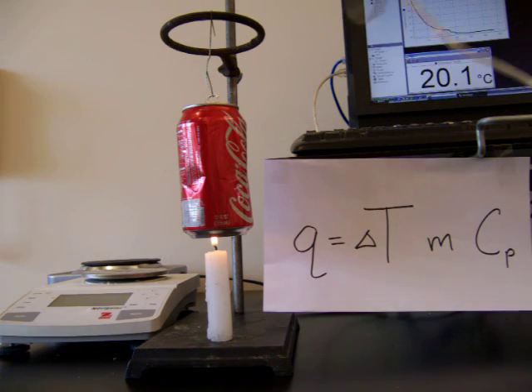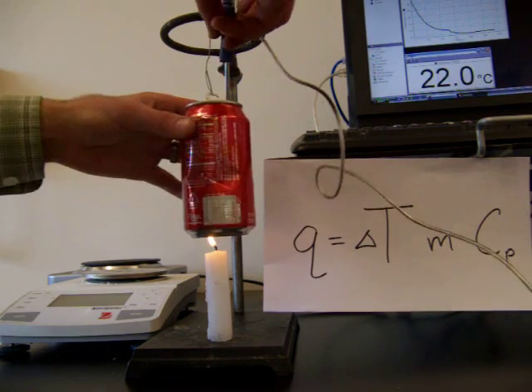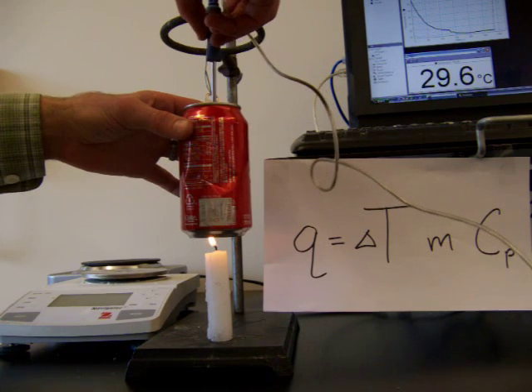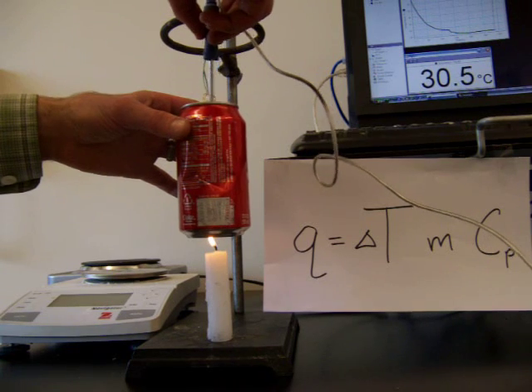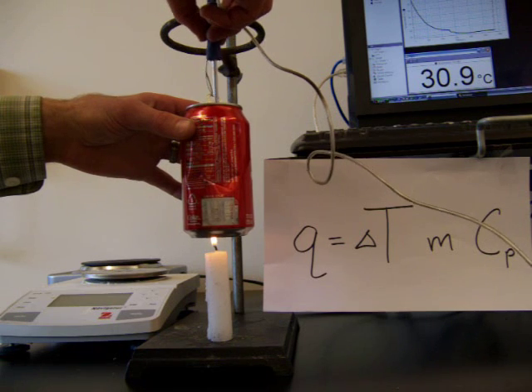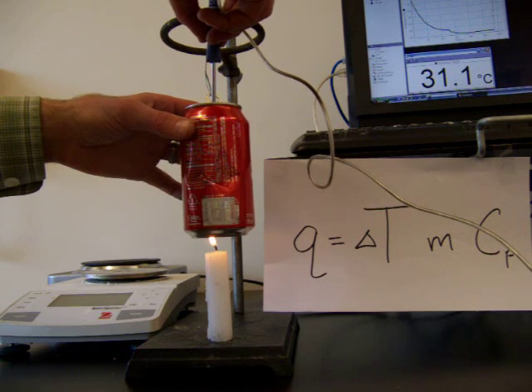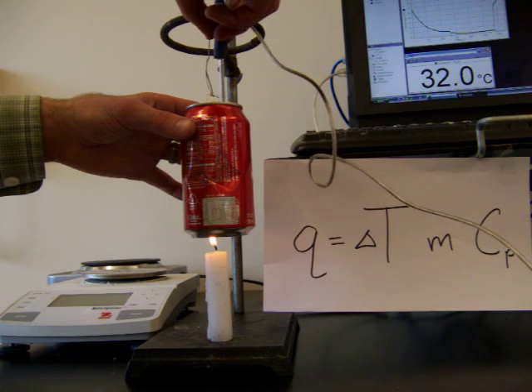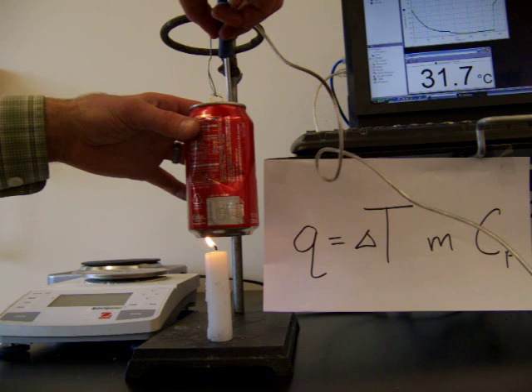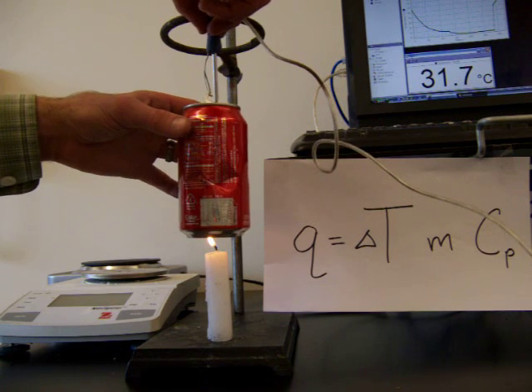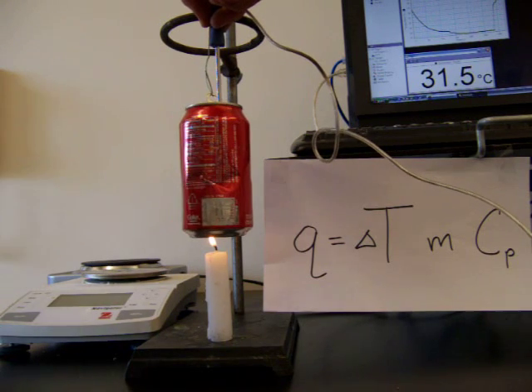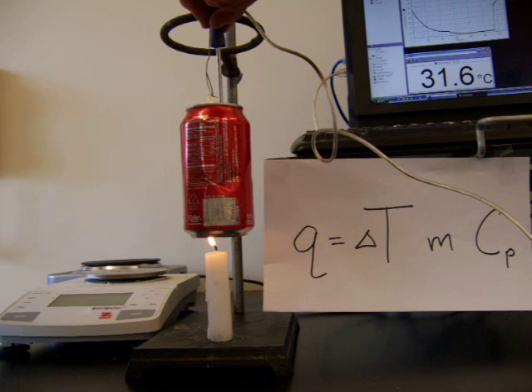Let's take our thermometer. We'll place it back into the soda can. And we can see that, yes, in fact, the water in the soda can has gotten quite a bit warmer. Let's stir it around a little bit so we get an accurate reading. And it looks like we have about 31.7 degrees so far. So we're up about 31.7 degrees for our water in the soda can. So there's a fair amount of heat being put off by the candle into the water in the soda can.